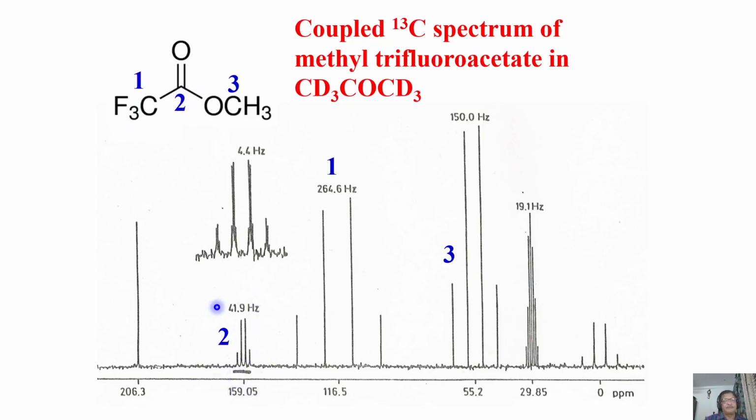That's also fine. But one interesting thing happened. This region is expanded here. If you look at it, when you expand, it is not just a quartet. Each line of the quartet is another quartet. See, it's a quartet of quartets. Where is the second quartet coming from?